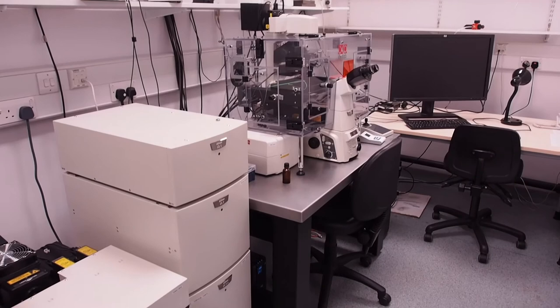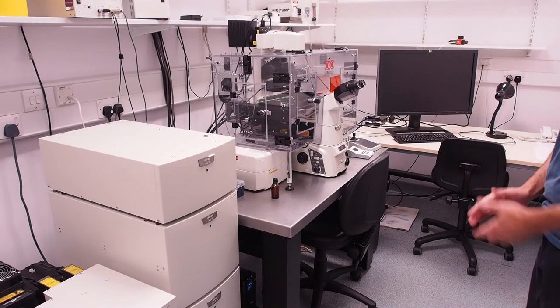This video shows you how to start up the Nikon A1R confocal microscope at the centre for life and add a sample to an air or oil immersion objective.